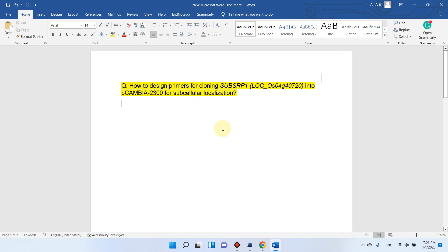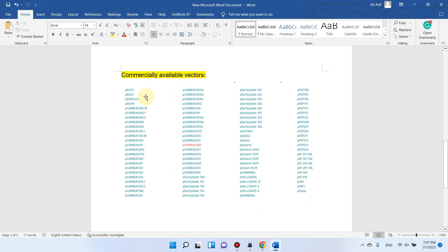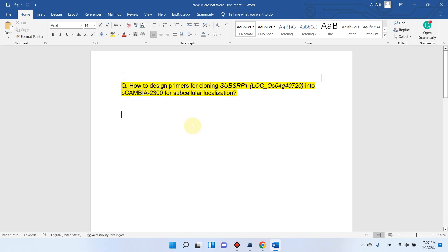Welcome to another video tutorial. In this video I will show you how we can design primers for cloning your gene of interest into any vector. Someone has asked how we can design primers for cloning a gene into pCAMBIA 2300, and the purpose for this cloning was subcellular localization. There are many vectors commercially available from different biotechnology companies, and among them they want to use pCAMBIA 2300 for subcellular localization.